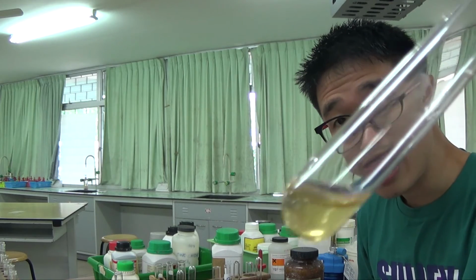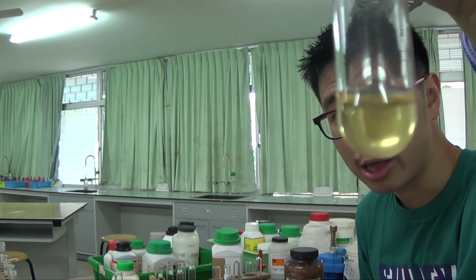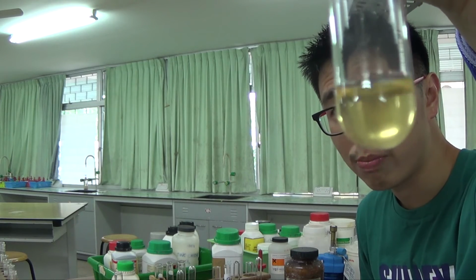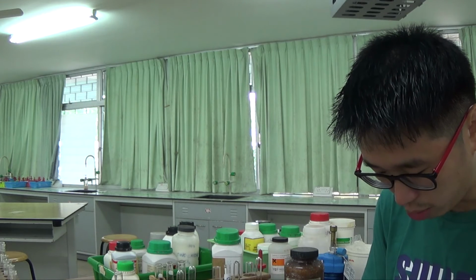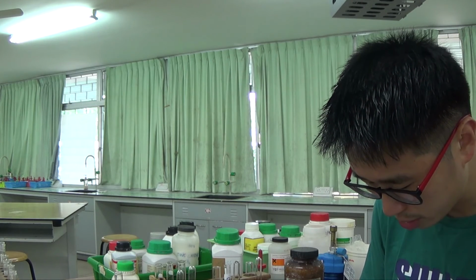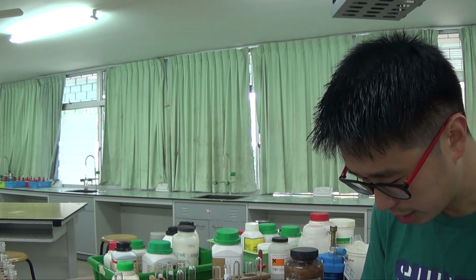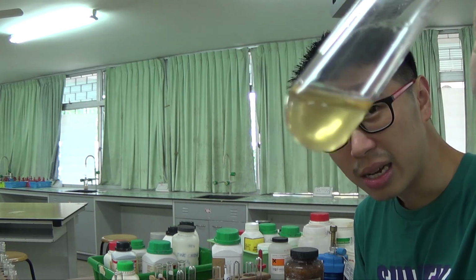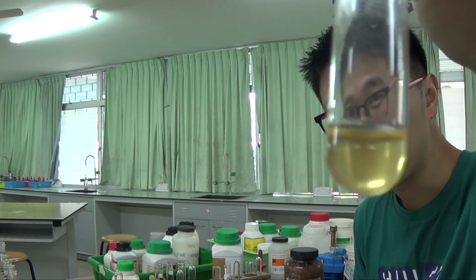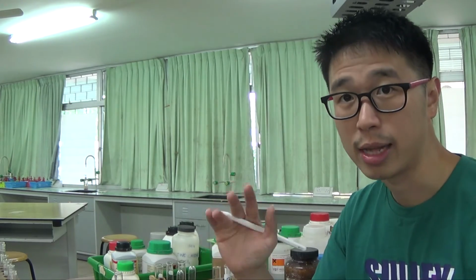So when you have iron 3+ aqueous, there is no hydroxide. This is a solution. This is not a reddish brown precipitate. Why? Because this is in aqueous. Aqueous means in water, not OH-. So Fe3+ aqueous is a yellow orangey kind of solution. Iron 2+ aqueous is supposed to be a pale green kind of solution.